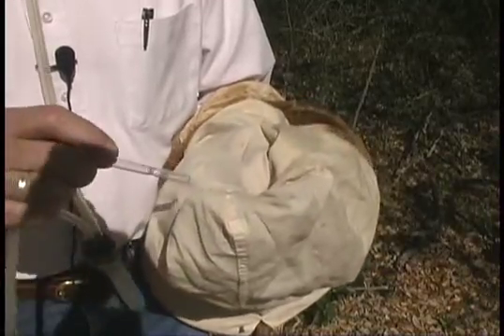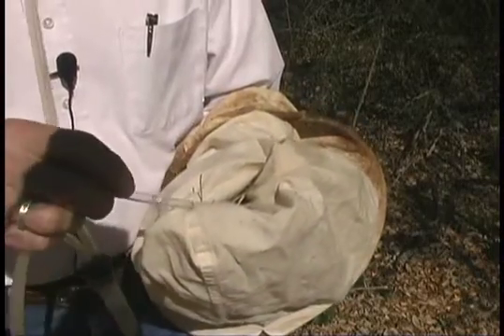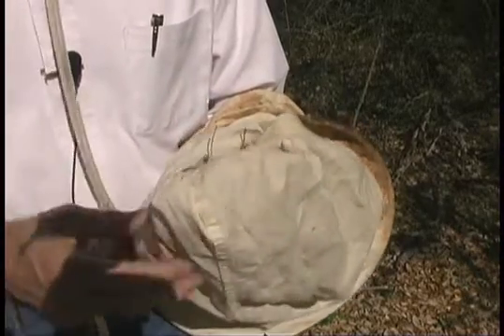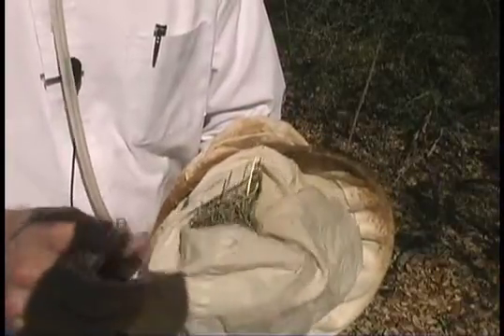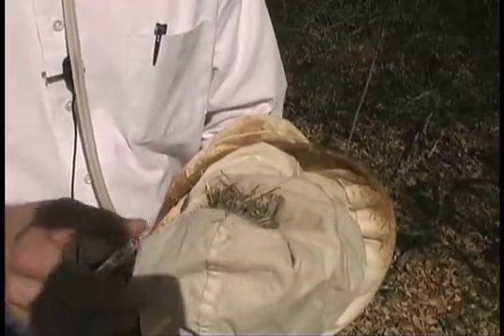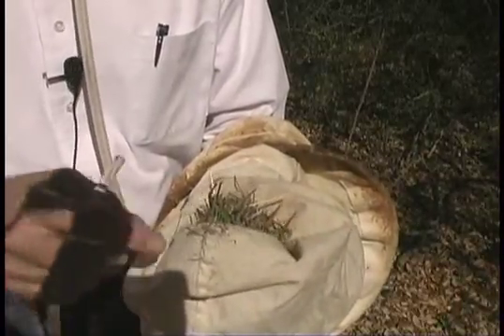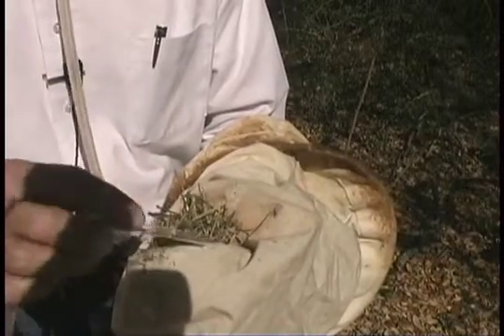Here's a small ant. What I'll do is just kind of sift through this material, and as small insects come up, hopefully I can catch them as they get onto the net without losing them. Here's a weevil.